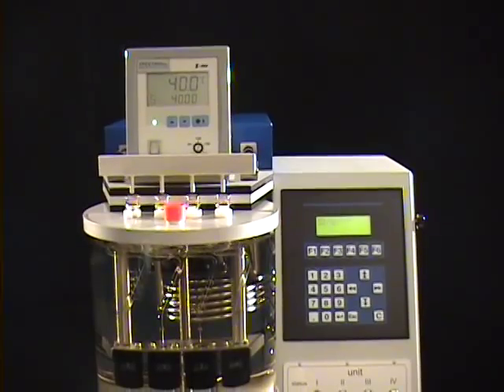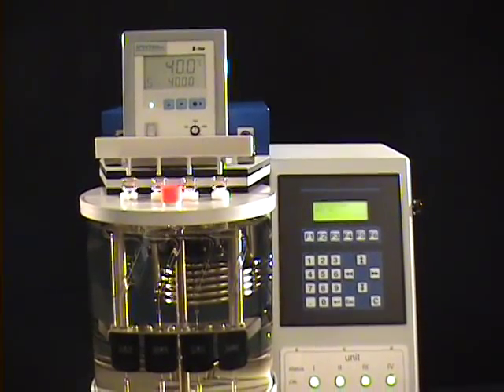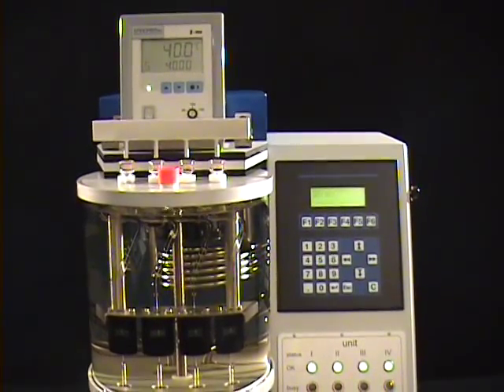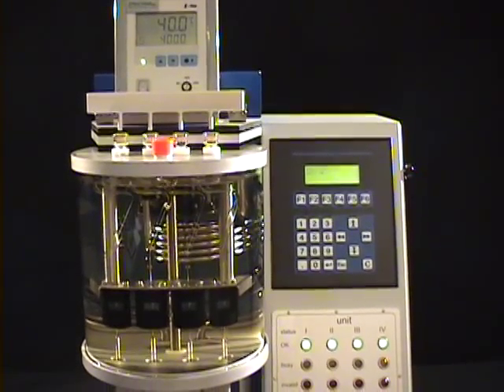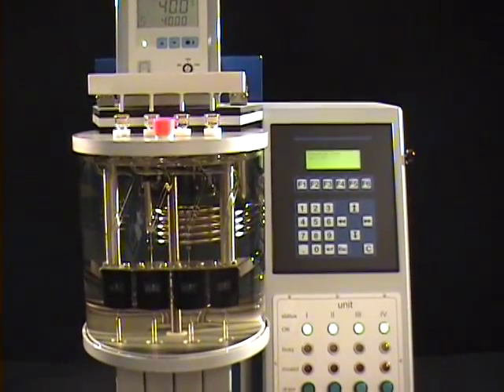The SpectraVisc is a benchtop temperature bath viscometer optimized for the analysis of used and new lubricants. It is an ideal system for anyone looking to test a wide range of lubricant viscosities.